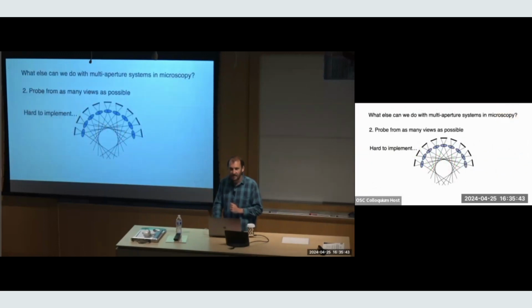Okay, and then the last manifestation, but probably the most interesting for 3D capture, is trying to capture many, many more angles, right? So I just showed results where we captured 30 to 40 degrees of angular perspective. Ideally, we would somehow just image all around some specimen, right? If we really wanted a tomographic measurement to get full 3D. So we've thought a lot about this, and we just haven't implemented it yet. I don't know, maybe we will.